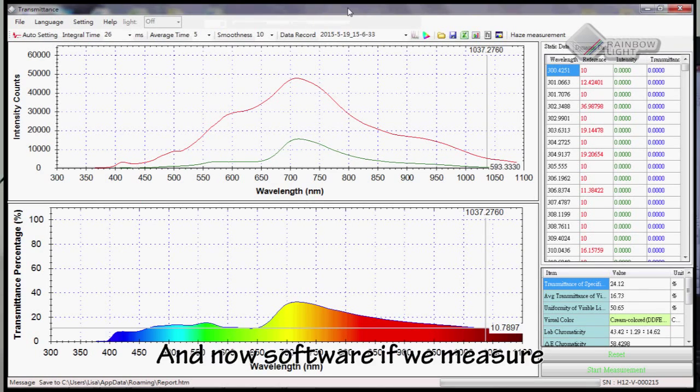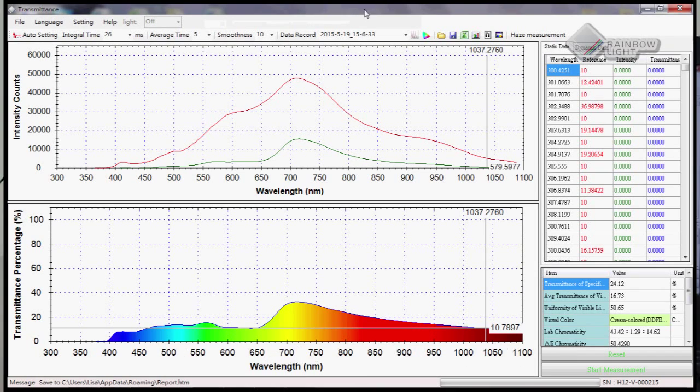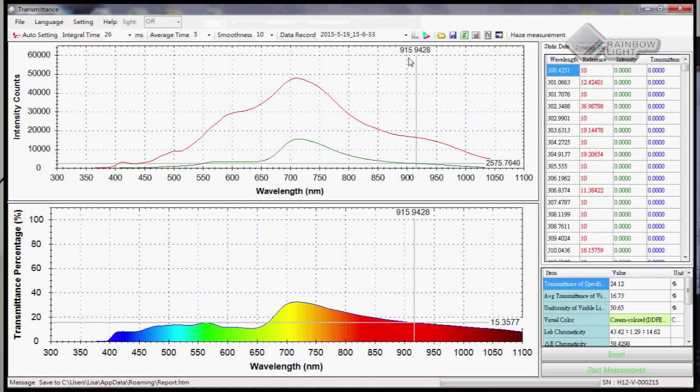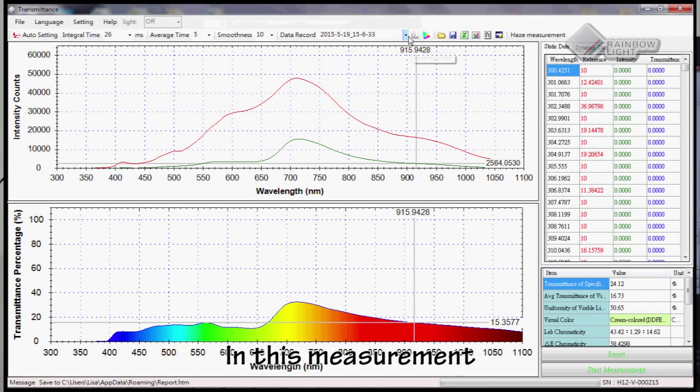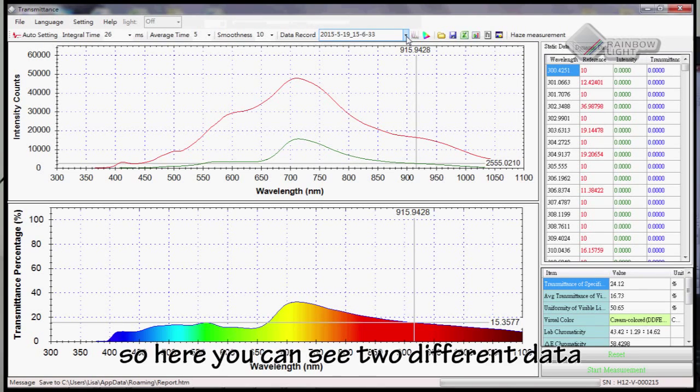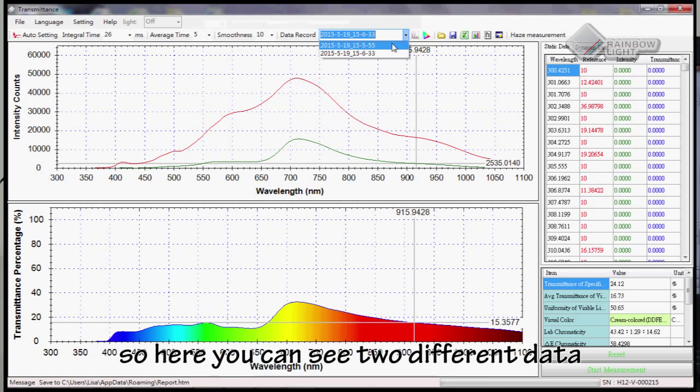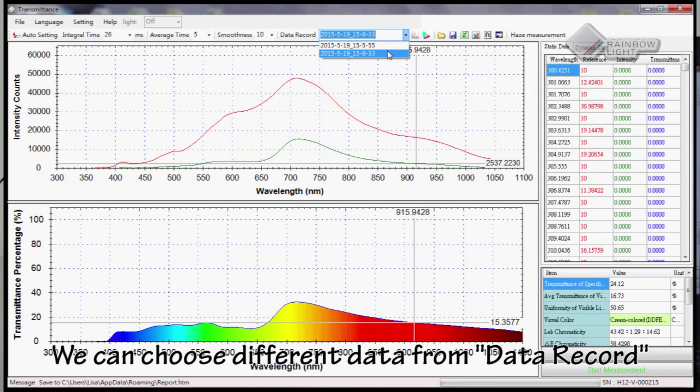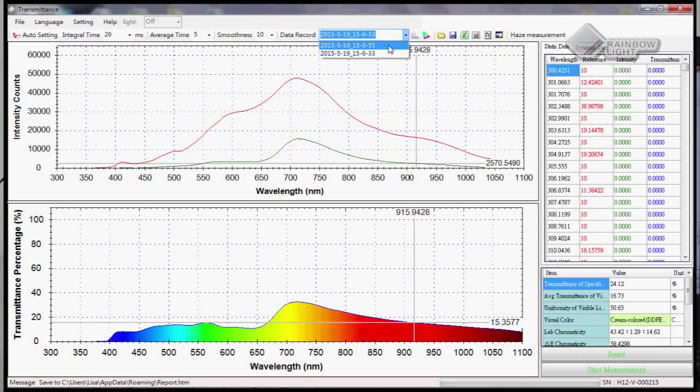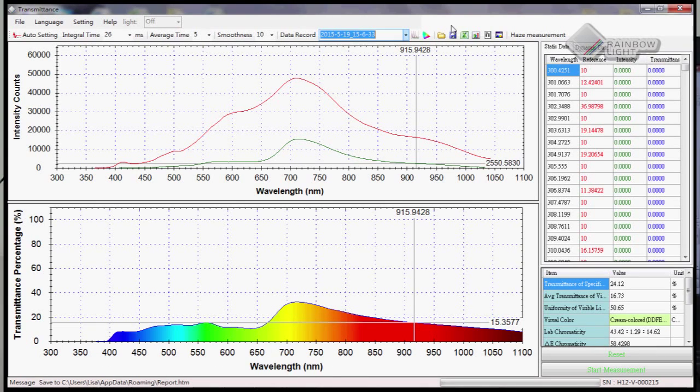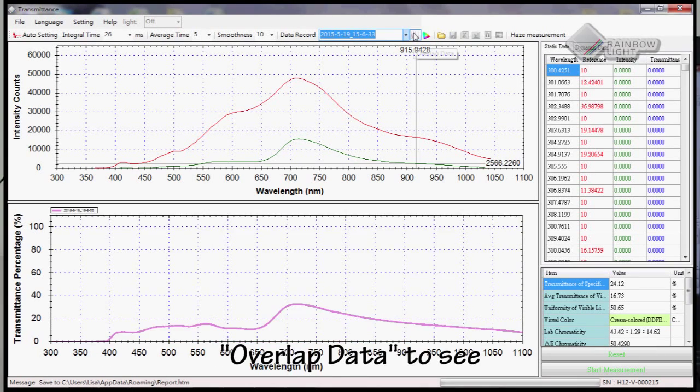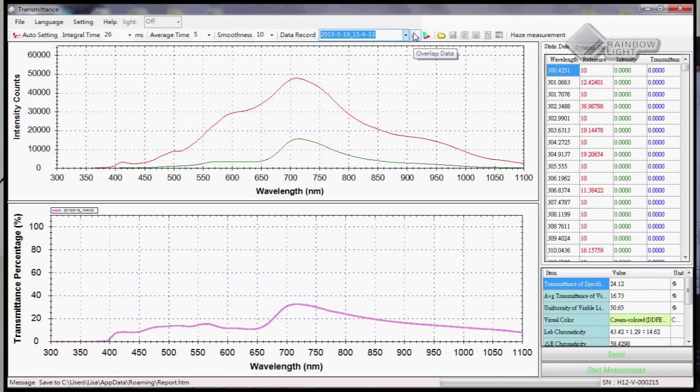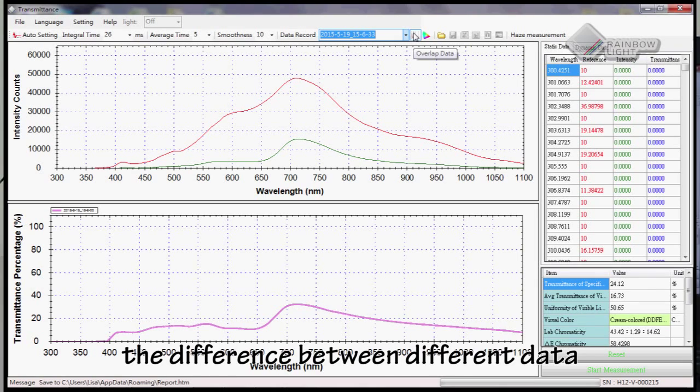In our software, it will measure many times, so we will have many records. In this measurement, we measured twice, so here you can see two different data sets. We can choose different data from data record and then use overlay data to see the difference between different measurements.